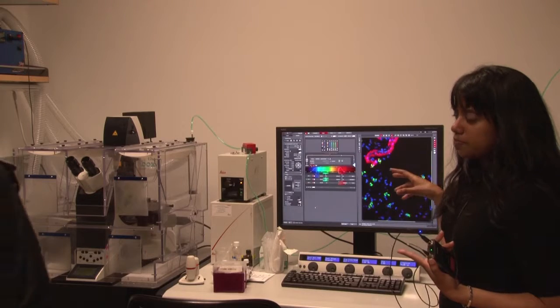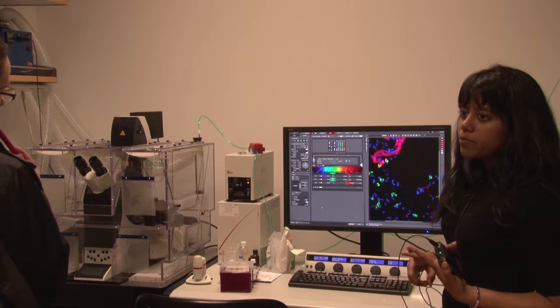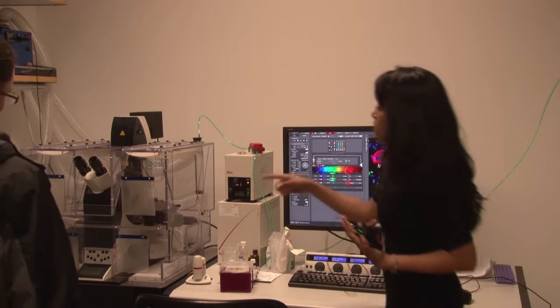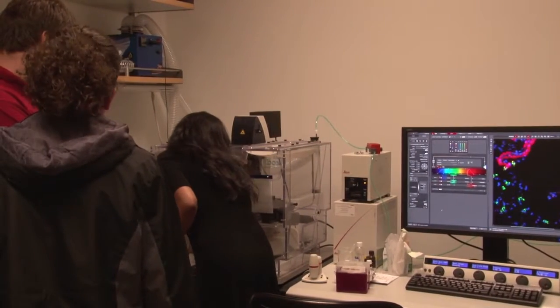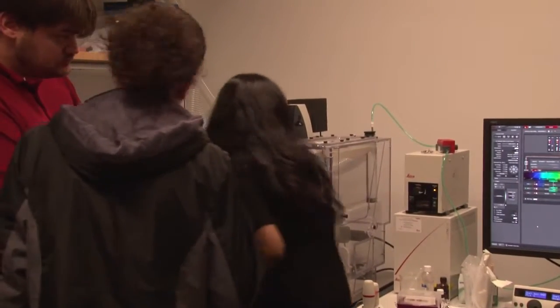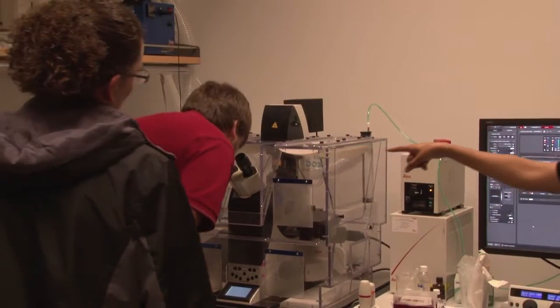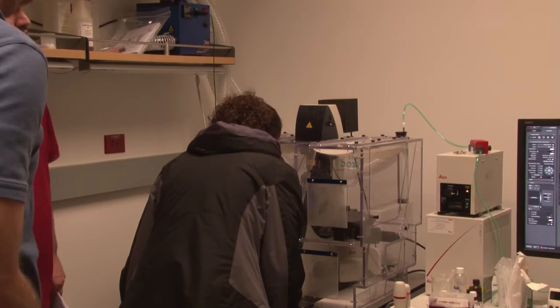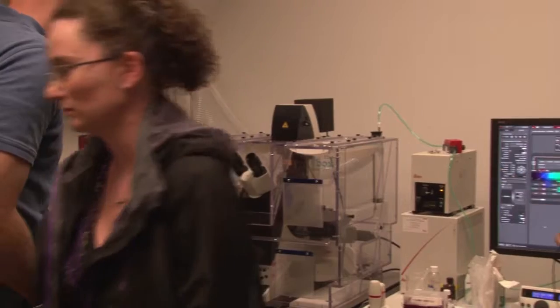Set of cells in the lung, in green 488, and secretoglobin, which marks club cells in the airways, in Cy5. So you guys can have a look. I think I've already set it up. You can just have a look at how the signal looks. So this is the 488 channel. You can see puncta for SPC in a few cells. That's typically how it would look.